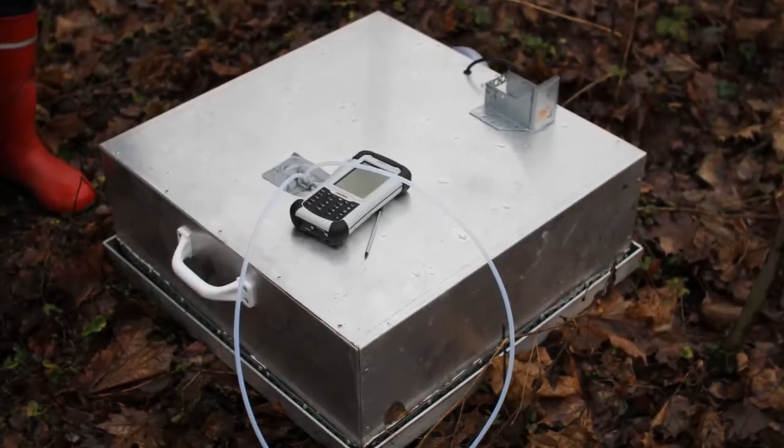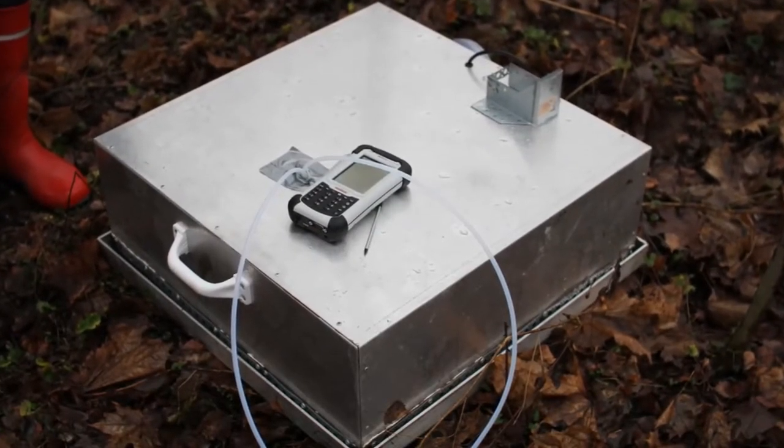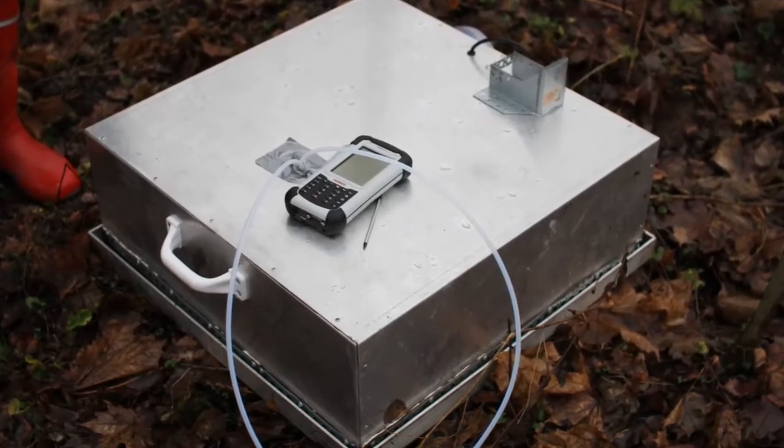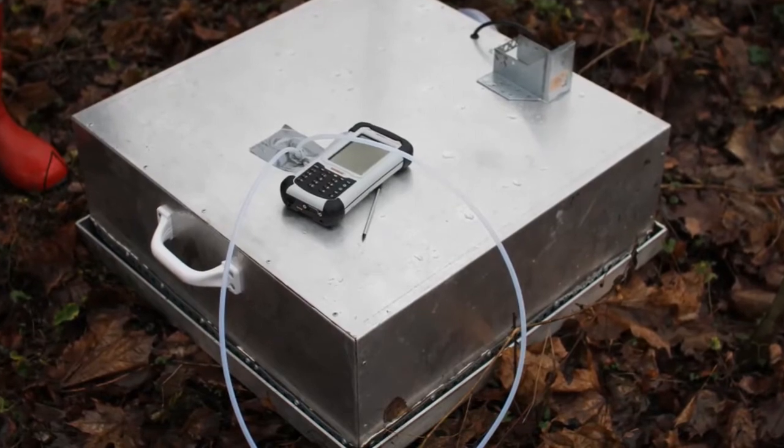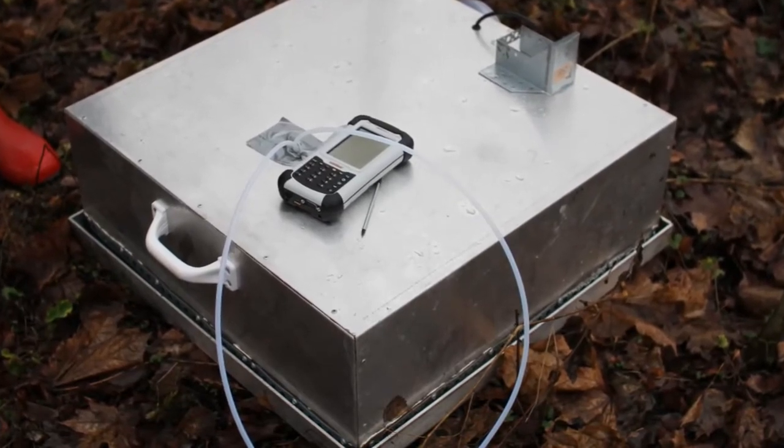In this demonstration, a homemade chamber was used. Another option is to use an automated chamber manufactured by a specialist company. Both types of chambers are equally suitable for GASMED gas analyzers.